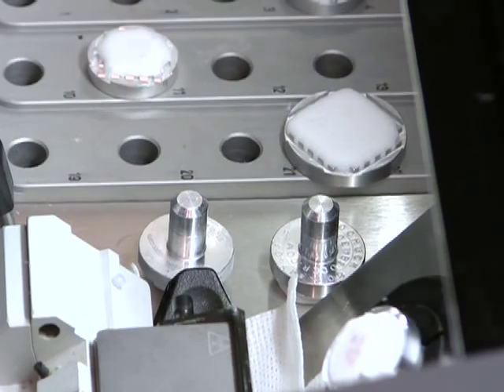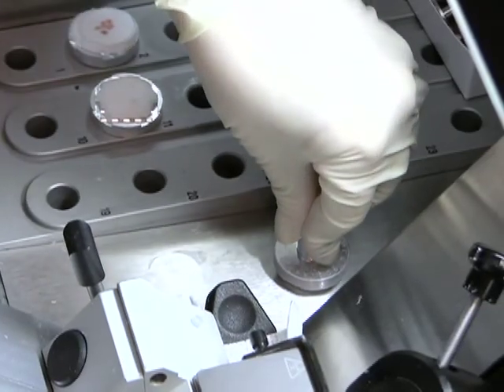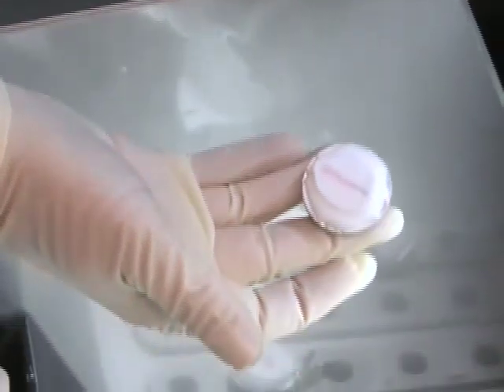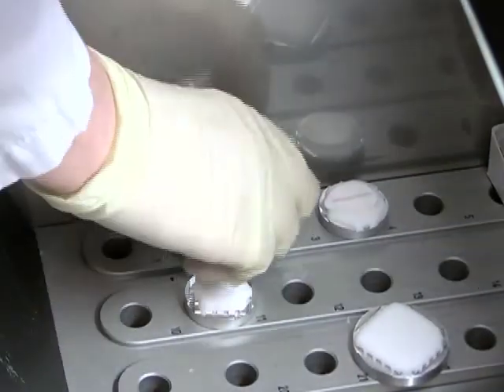This can be done on larger or darker specimens by putting a drop of embedding medium over the bare tissue and placing it on the floor of the cryostat. With smaller specimens that may be difficult to see, simply smooth a thin layer over the bare tissue in order to provide a protective layer, yet still see the shape of the specimen.